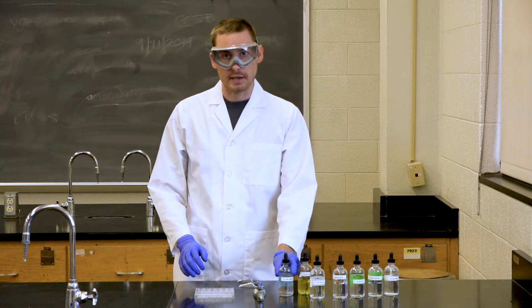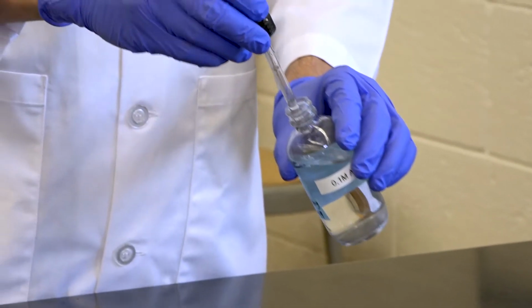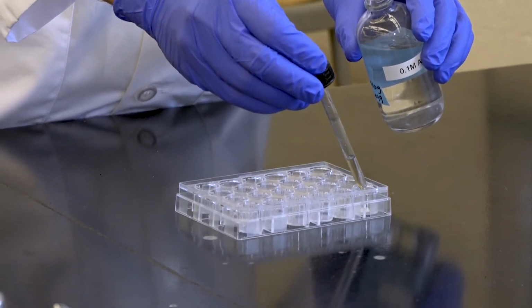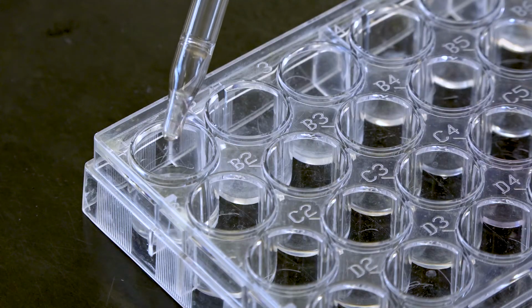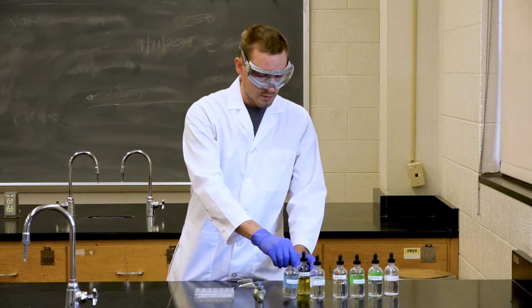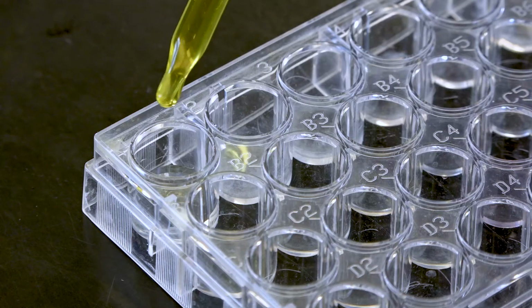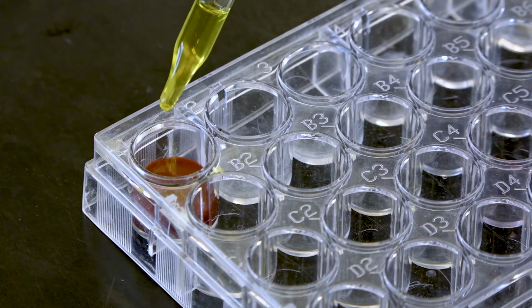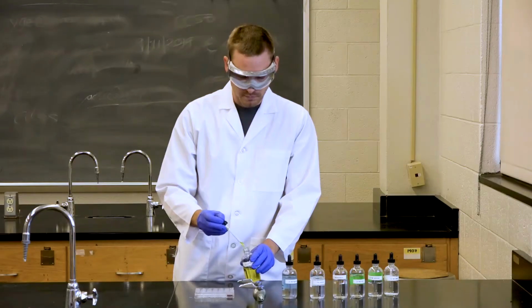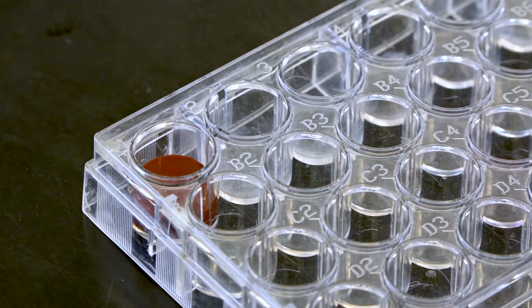First, you will add a couple of drops of silver nitrate to the first well on your well plate. You will only need a couple drops, but for the purpose of this experiment, we're going to use some more so that you can see what reaction takes place. After adding the silver nitrate, you can then add the potassium chromate. As you can see, a brownish red precipitate formed when we added the potassium chromate to the solution.